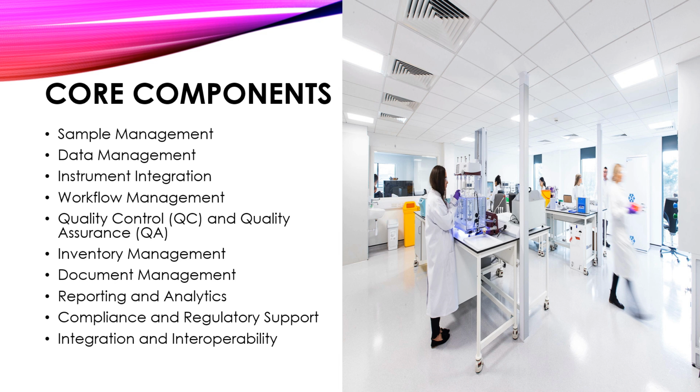Compliance and regulatory support. A laboratory management system helps laboratories to adhere to regulatory requirements and standards such as CLIA, CAP, HIPAA, and GDPR. It ensures data security, confidentiality, audit trails, and compliance documentation for regulatory inspections and accreditation processes.